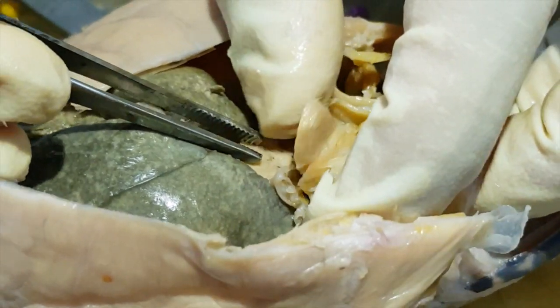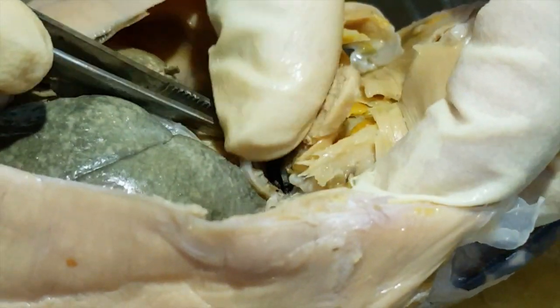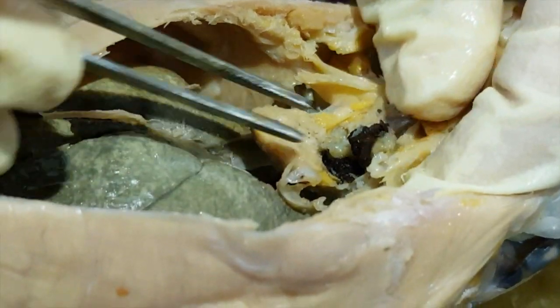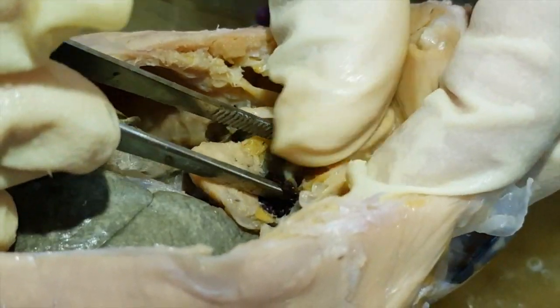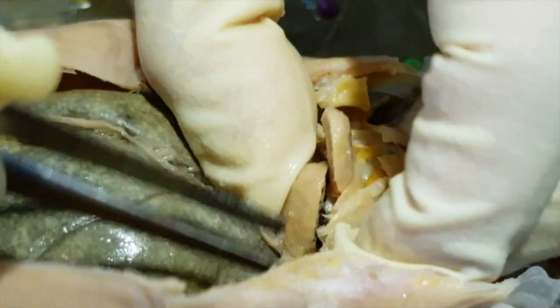I cut it on a section that will reveal the chambers. This thick portion here is the ventricle, and the ones on the top are the atrium. You see that there is still blood present.